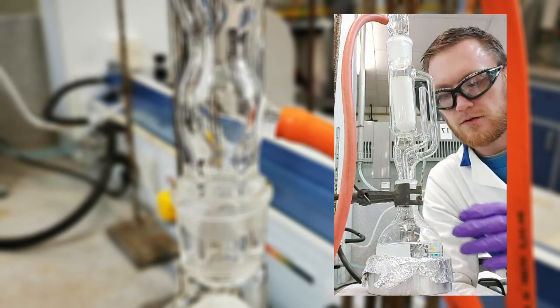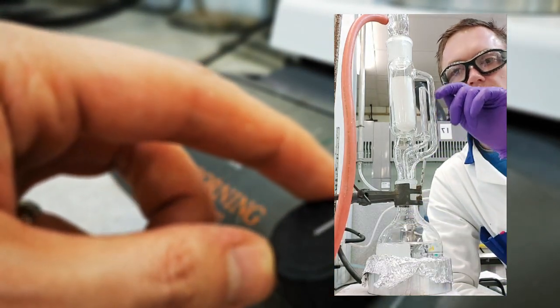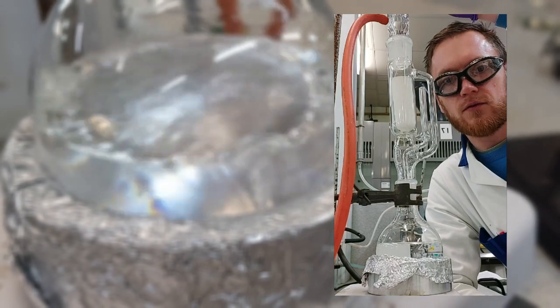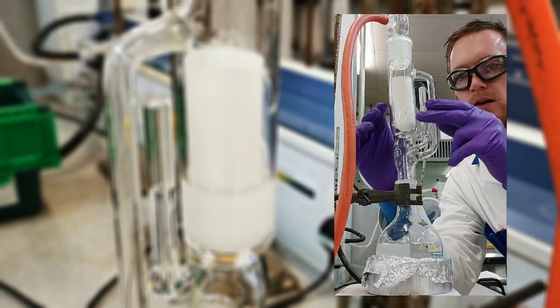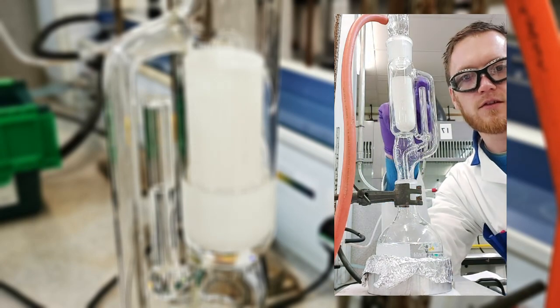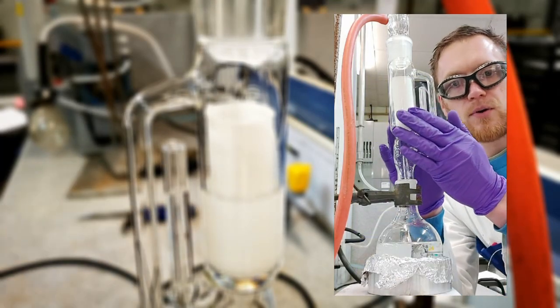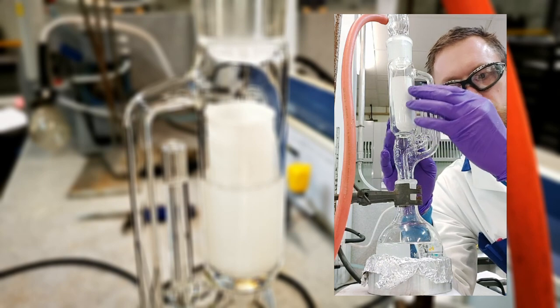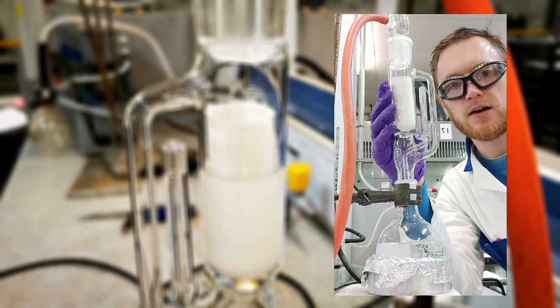So during the Soxhlet extraction, what happens is the solvent is heated. It will then boil. The solvent vapor will travel up the side arm and then cool down at the condenser here. So in the condenser we've got water traveling through it, so that cools down the solvent vapor and it will condense the solvent. The solvent will drip back down into this cellulose filter here, and the warm solvent will start to accumulate in this little mini reservoir. Once the solvent level reaches this point on the side arm, the solvent will discharge back down into the main body of the flask. Now any compound in the thimble which was soluble in the toluene solvent which collects in here will dissolve in the toluene solvent and will ultimately flow back as a solution back into the main body of the flask. Any insoluble material will be left behind in the thimble.